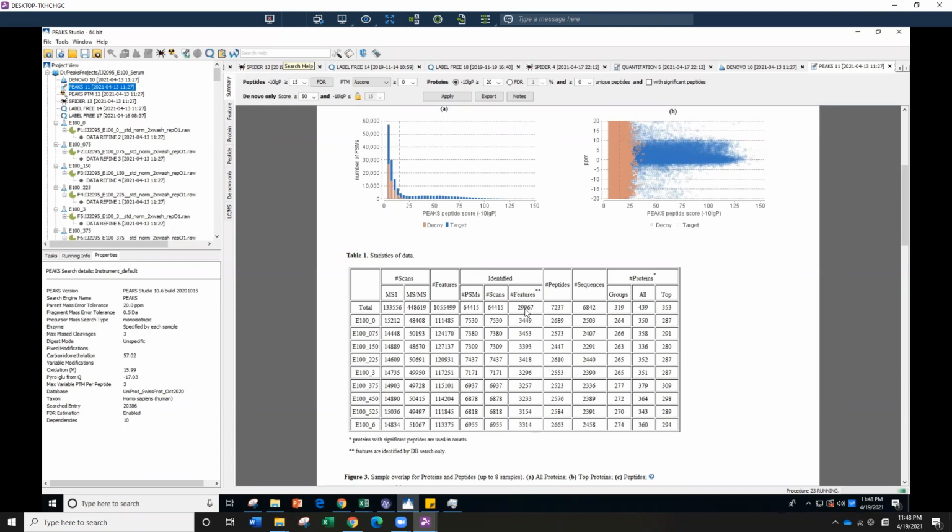Okay. Also, every time you want to look at how many peptides and how many proteins you have, notice that this is the total protein. I only have 400 total across the samples, which is weird. If you ever run a monthly standard, for example, you're looking at 2,800 to 3,400-ish.